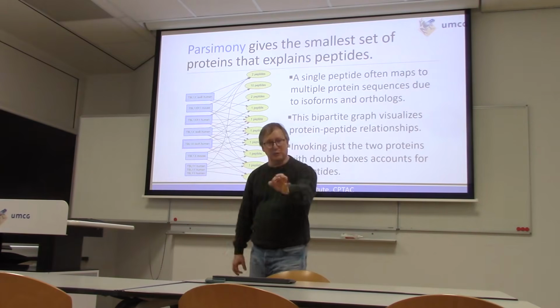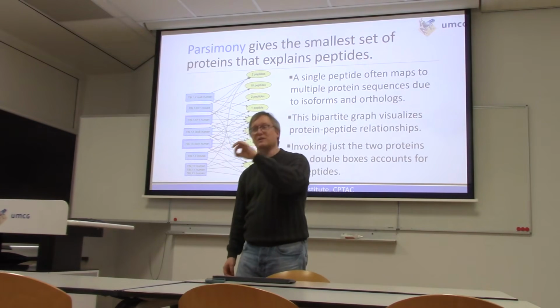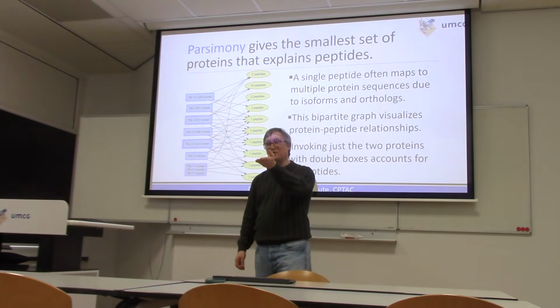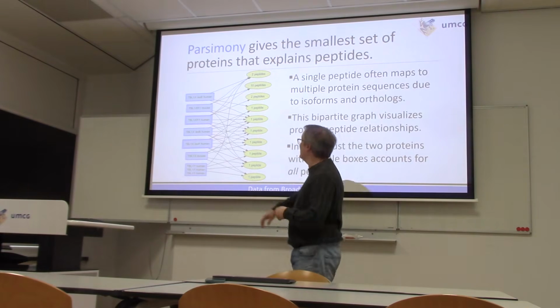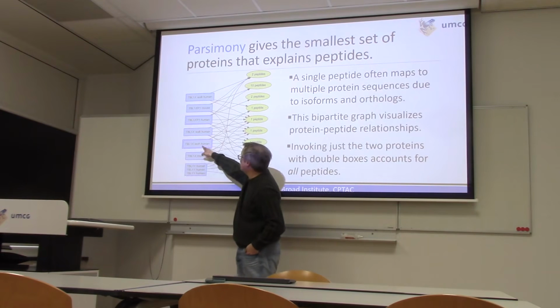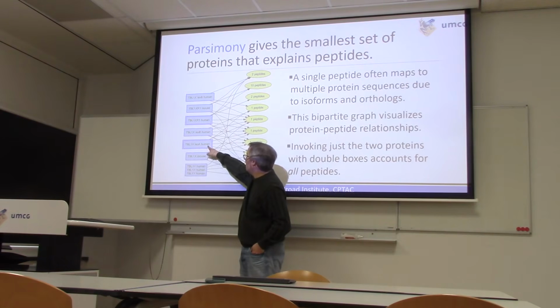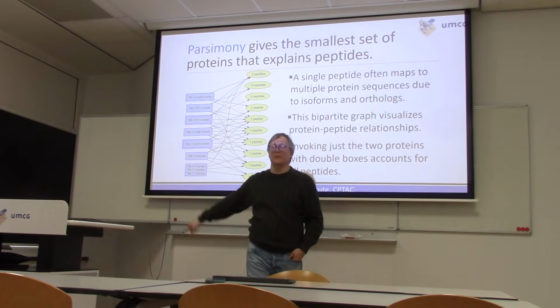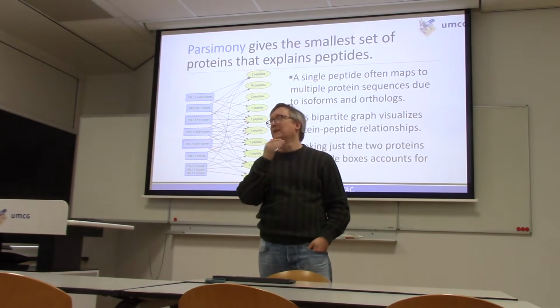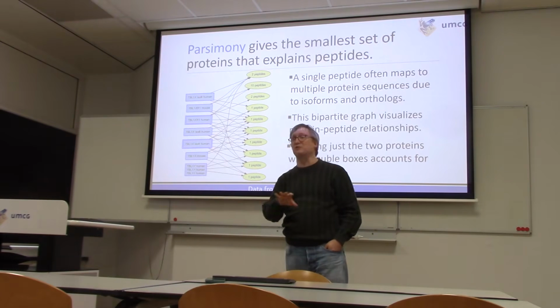But the tumor tissue we take from that mouse will have proteins from both humans and mice, because the stuff circulating through there is generated by the mouse, but those cells grew from human ones. So in this case, we now have this set of proteins that represent different isoforms of related genes, and they come from both human and mouse. How do we figure out which proteins are real from this set? There is not, I would say, a firm consensus in the field on how to do this.